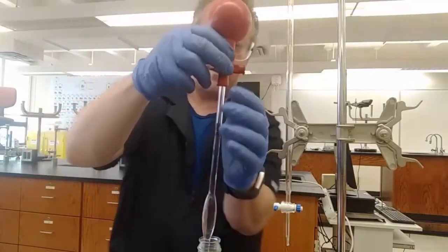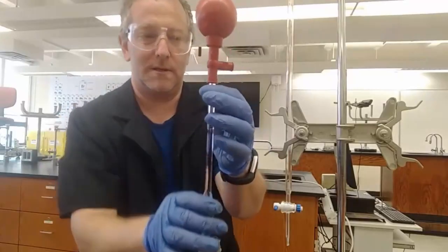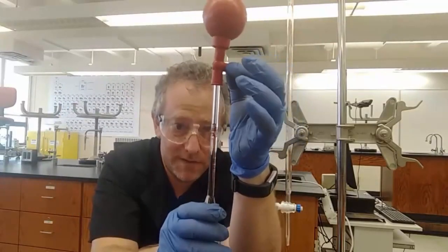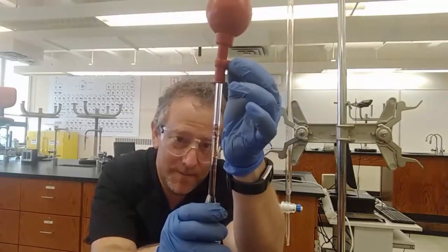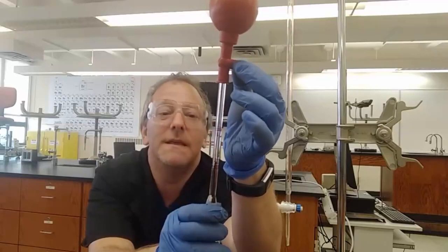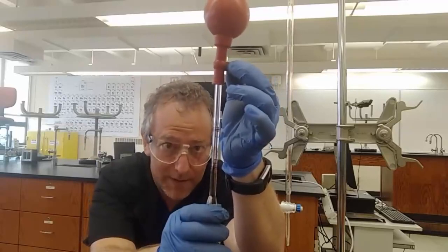So now, use the pipette way of doing it. I'll press the side valve to let the liquid drain out until the meniscus is exactly on the TD line, which is the top line on this one.